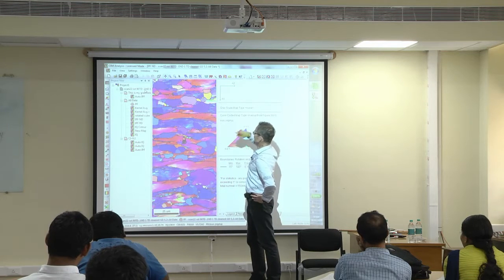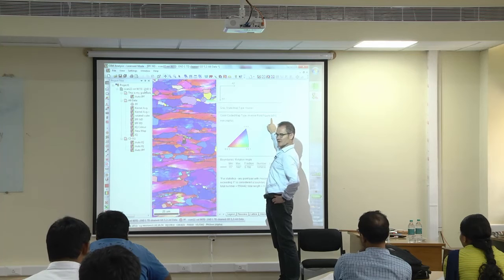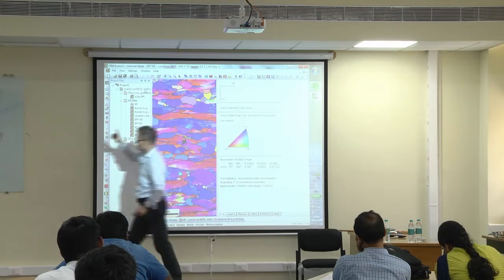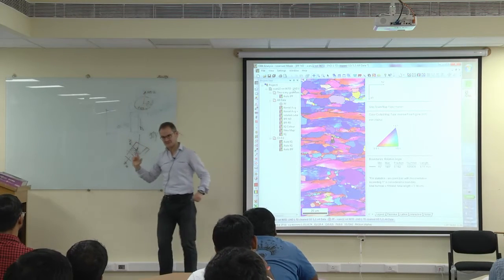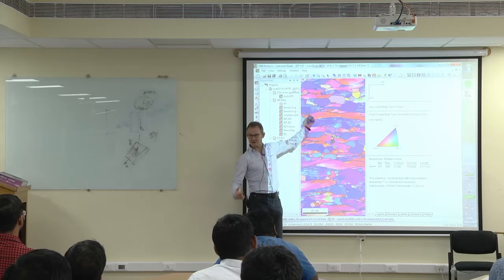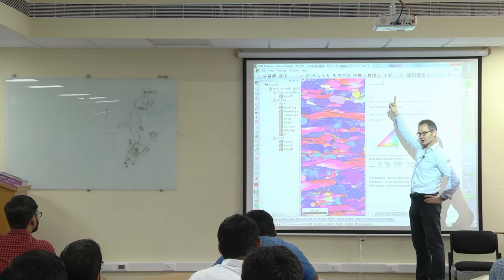So when I'm plotting the normal direction in colors, and that's what I'm doing here, I'm plotting the inverse pole figure for this sample direction. For the 001 sample direction, this is the z direction, x, y, z. And the z direction is usually the normal direction pointing out of the sample. So that's what I did. I rotated the data such that the normal direction is oriented like that. And at the same time, I'm plotting now this pointing out direction in colors.